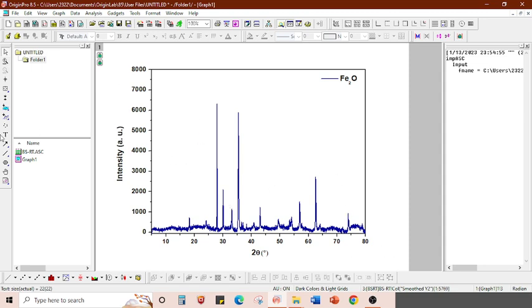But if you like to have the peaks indicated, suppose someone would say this is an oxygen peak, or this is related to Fe2, this is related to FeO. If you wanted to indicate or input the values, what you can do is go to text box. Let me say this is a value which is called 35. I'm going to write 35. I only have to mark it. I'm going to place the 35 here. Take this arrow. This is how it works.